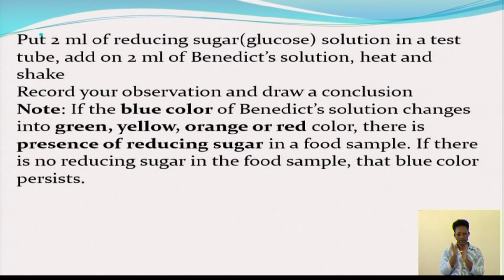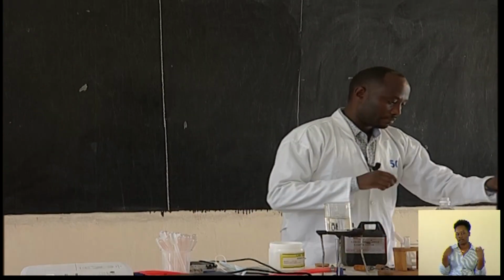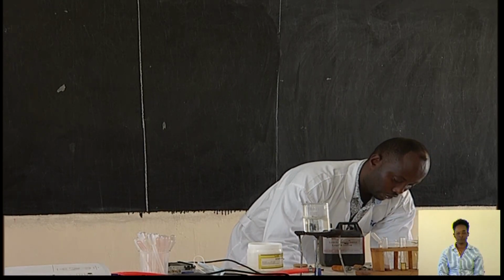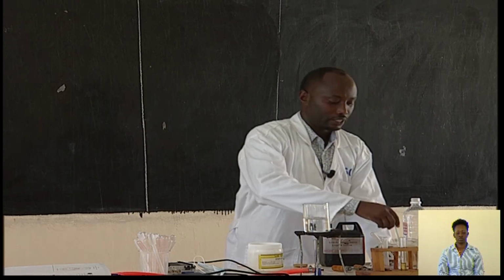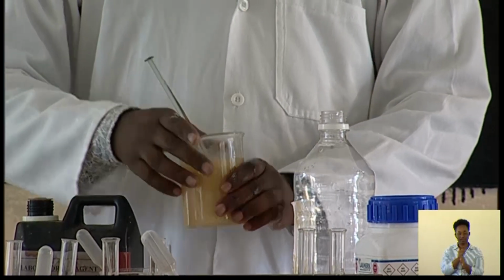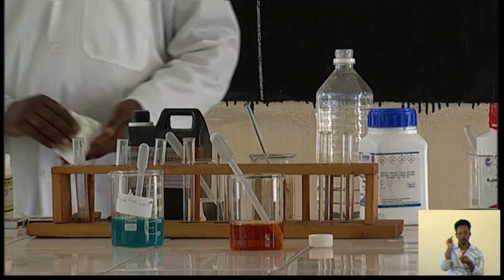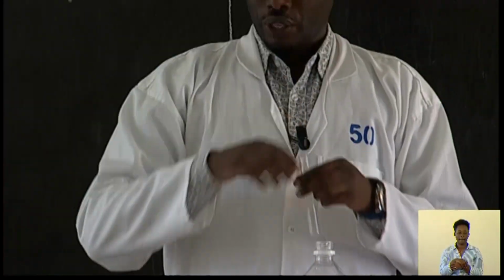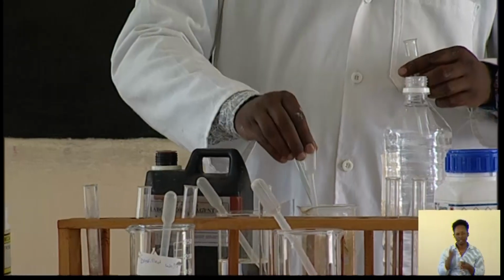Quickly, let me just do the experiment of how we can test, as you see, surely I have something here in front of me. I'll be trying to do the experiment clearly, and everybody can just observe. This is a crushed biscuit. Now I'm going to test whether the biscuit surely contains reducing sugars. Let me try to see if it contains reducing sugars.